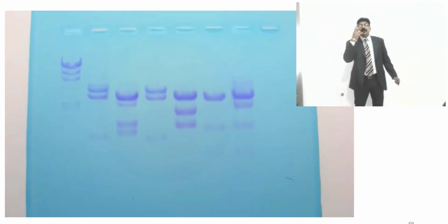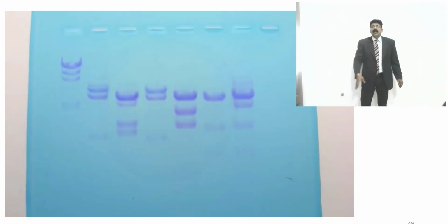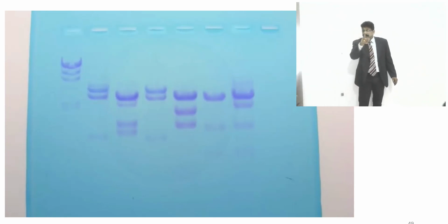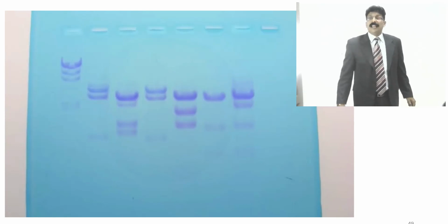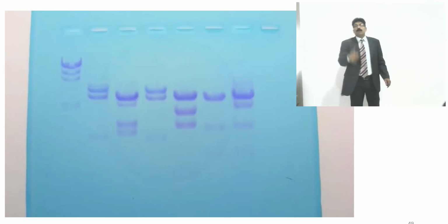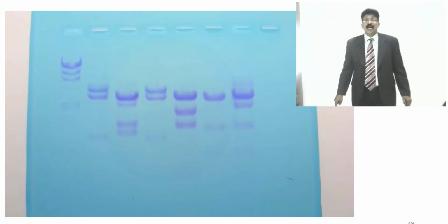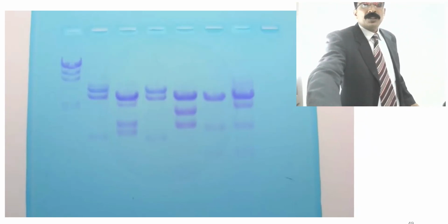The second one and the fourth one have a similar separation of DNA, very clear. So we can see these two are the same and the others are not. That is, this is the culprit. So by this they will find out which DNA is matching together. So sample number 2 and sample number 4 are showing the same DNA separation in the picture, which you can see from the experiment they have done. So this shows that the problem is solved very clearly.